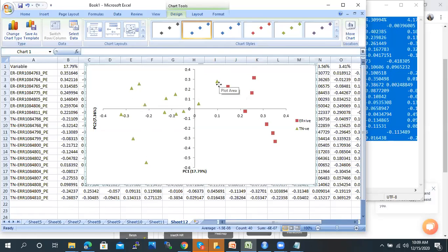Whenever you have data, first of all, to understand what the possible patterns within your data could be, you can always go for PCA. Is it clear to everyone? How we can visualize the pattern of our data? In the transcriptomics 2 course, you will find a video on how you can plot this scatter plot once you have PCA components. Now we can clearly see that there are two types of samples that are different from each other.